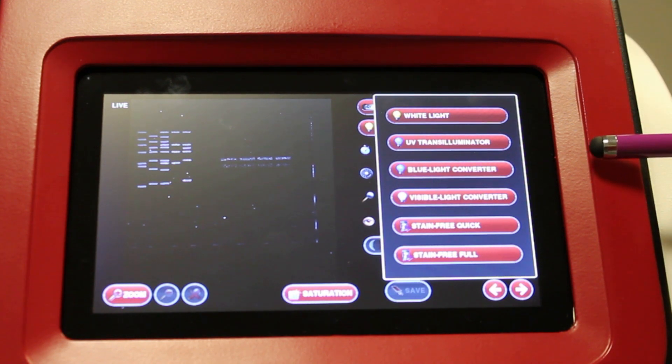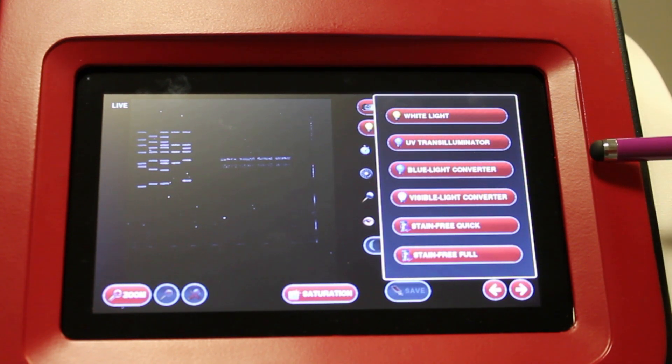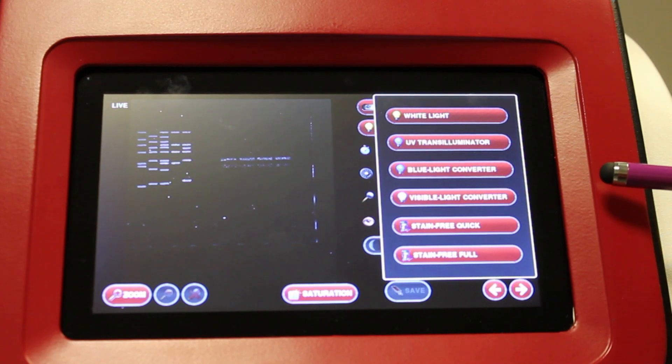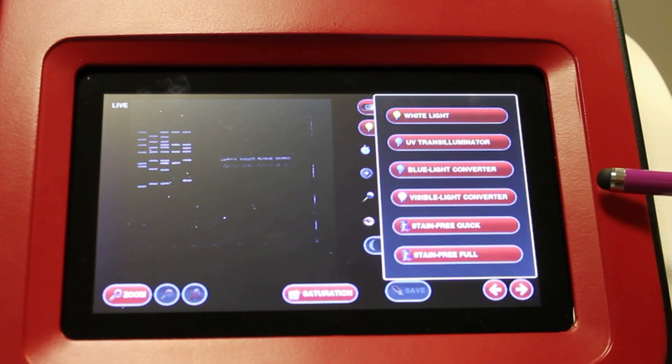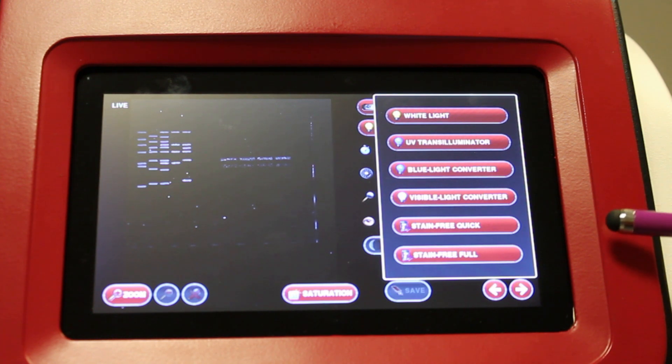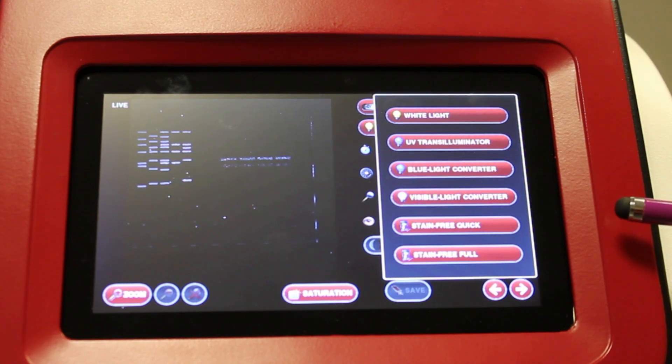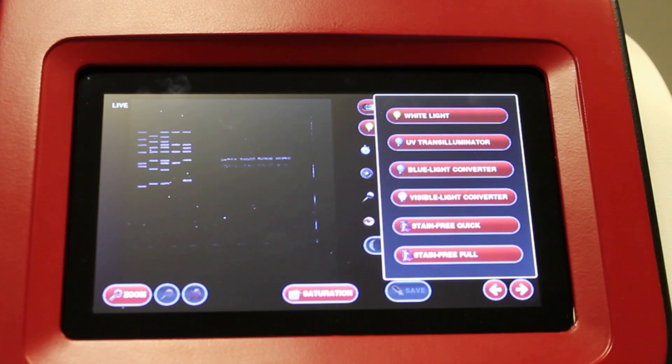You can also use the visible light converter screen for imaging Coomassie blue and silver stained gels. And if you have the Neugenius Plus version, you can also image stain-free gels.